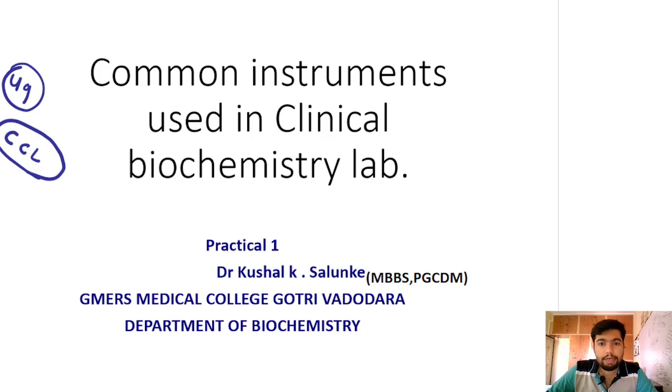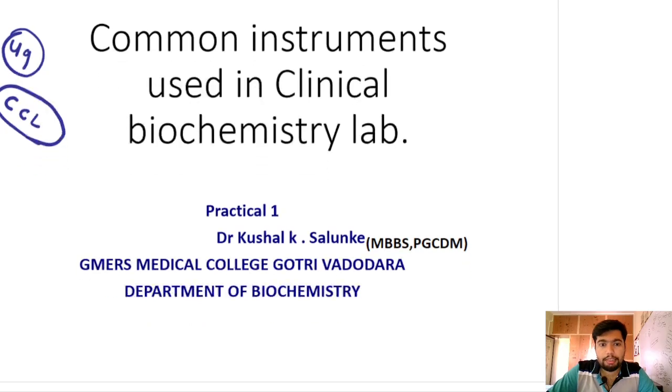So in this basic practical we will cover what the common instruments are, why these instruments are important, and the main thing, what the role of the biochemistry lab is, and what kind of tests we are performing in the biochemistry lab. All that we will be discussing in this particular practical. So let's start the practical.